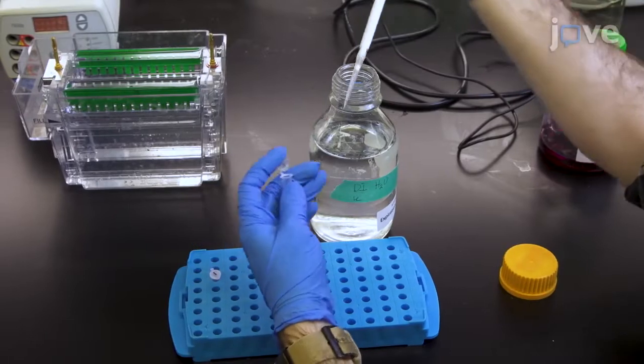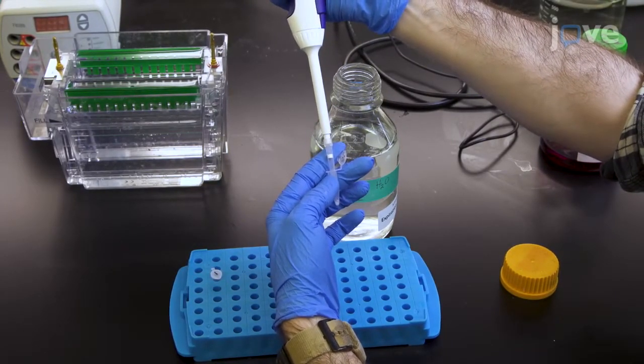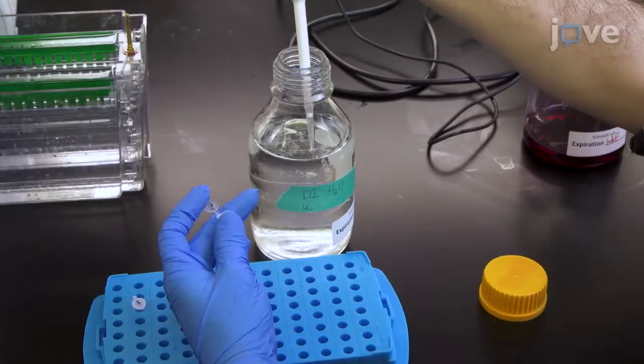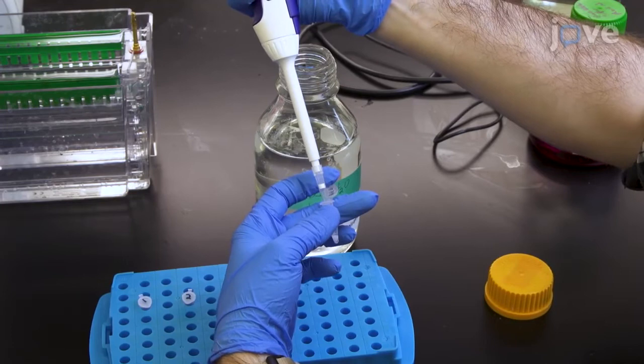This protocol describes a simple technique that can be used to detect the presence and measure the length of glycosaminoglycans, which are molecules of increasingly recognized significance to many biological processes.